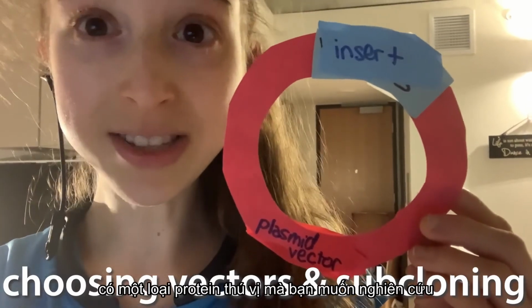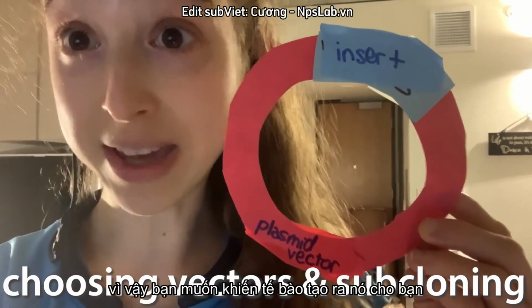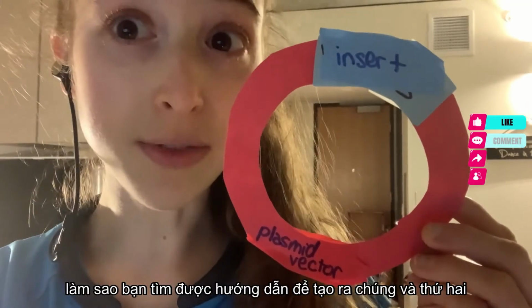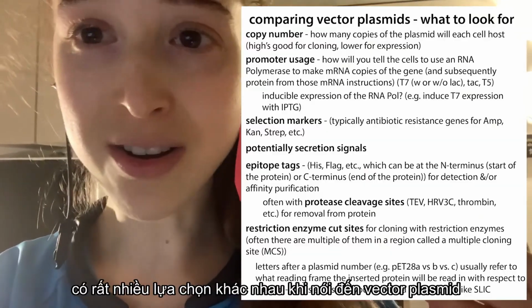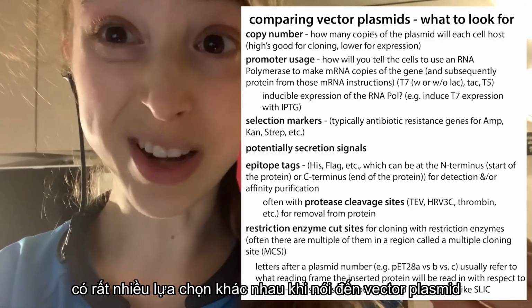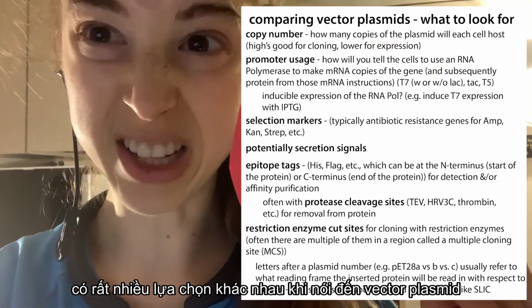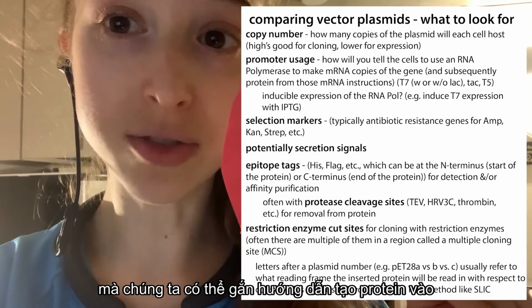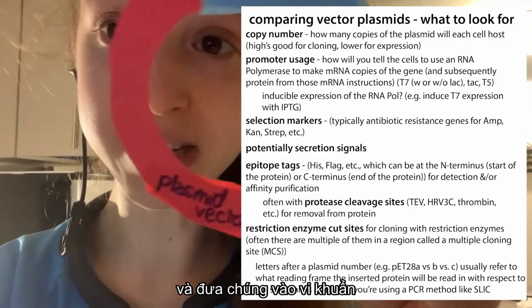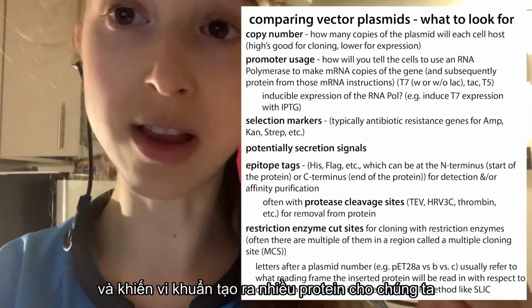Some cool protein that you want to study, so you want to get cells to make it for you. First of all, how are you going to find the instructions for making them? And second of all, where are you going to put them? There are lots of different options when it comes to plasmid vectors, which are these circular pieces of DNA that we can stick the instructions for making a protein into, and stick this into bacteria and get bacteria to make a lot of it for us.